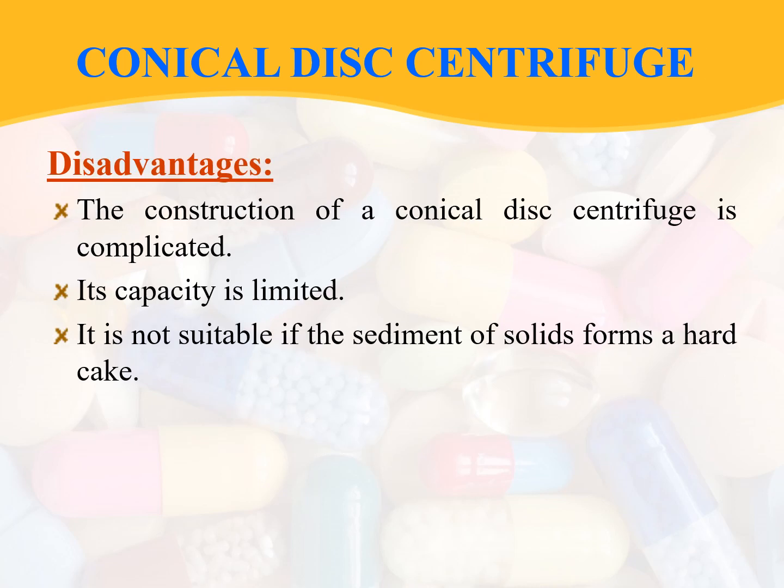Coming to the disadvantages, the construction of a conical disc centrifuge is complicated, it is capacity limited, and it is not suitable if the sediment of solids forms a hard cake. These are some of the listed disadvantages of the conical disc centrifuge.